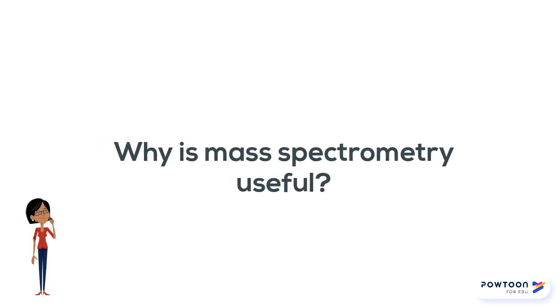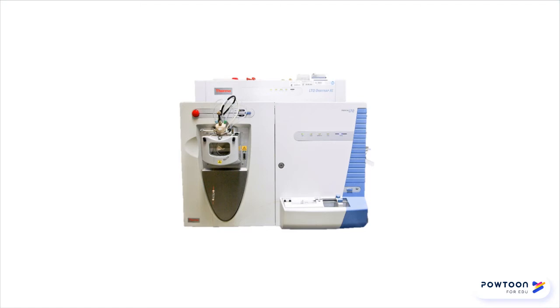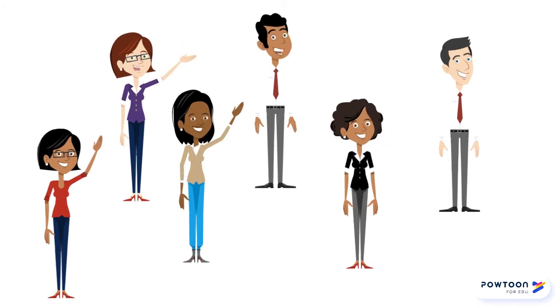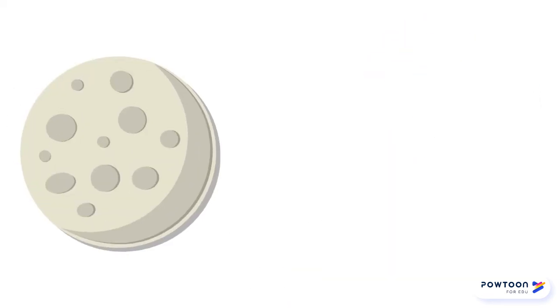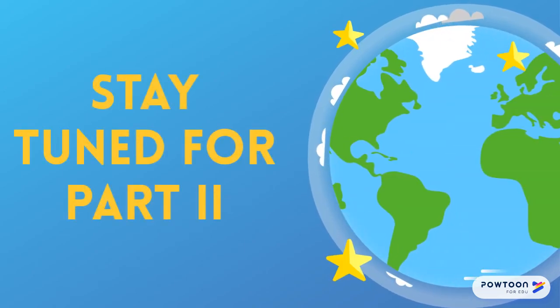Perhaps the most important question is, why is mass spectrometry useful? MS is one of the most versatile analytical methods currently available. It can analyze a range of species using a single sensor. Mass spectrometers are used by physicists, chemists, biologists, physicians, astronomers, geologists, so pretty much every type of scientist. They are routinely used to monitor nuclear facilities, detect environmental pollutants, and diagnose drug abuse. They have also been used to explore outer space as well as deployed in the ocean. In a follow-up video, I will focus on the applications of MS. In particular, I will discuss the emerging field of underwater mass spectrometry.